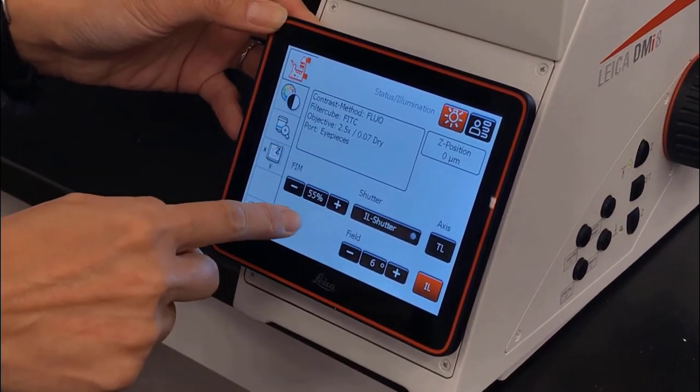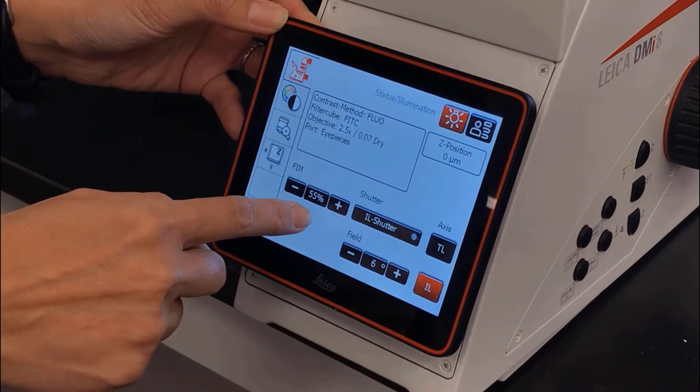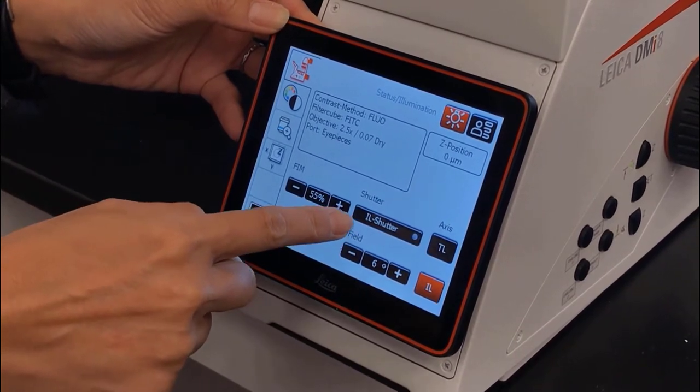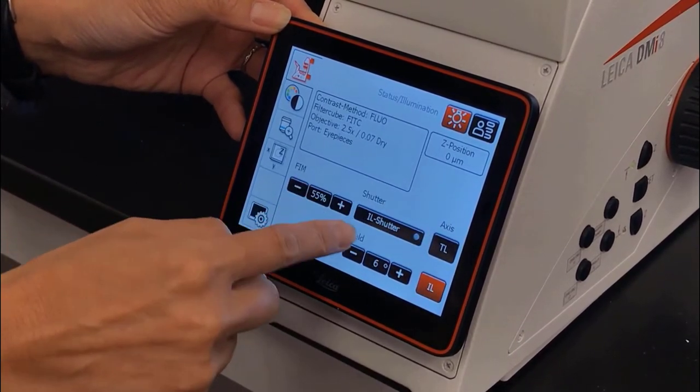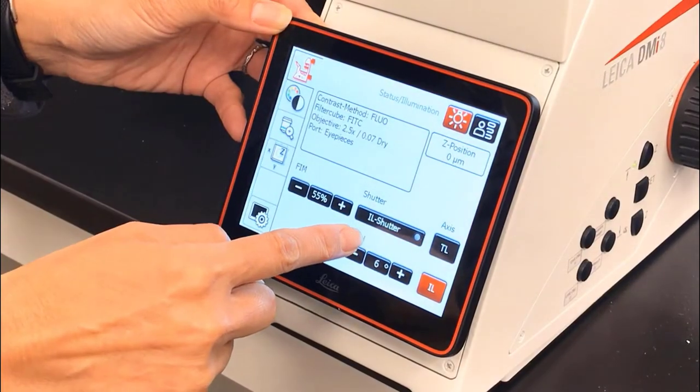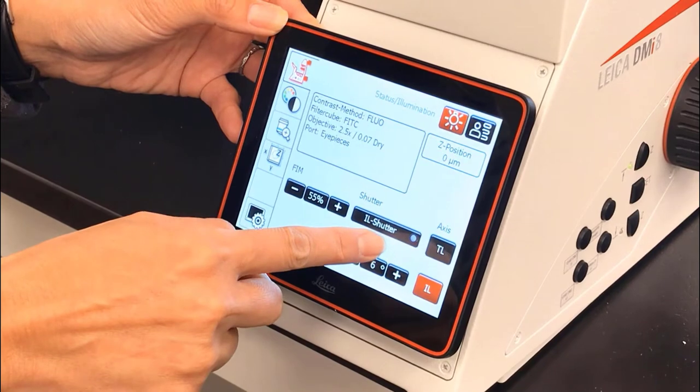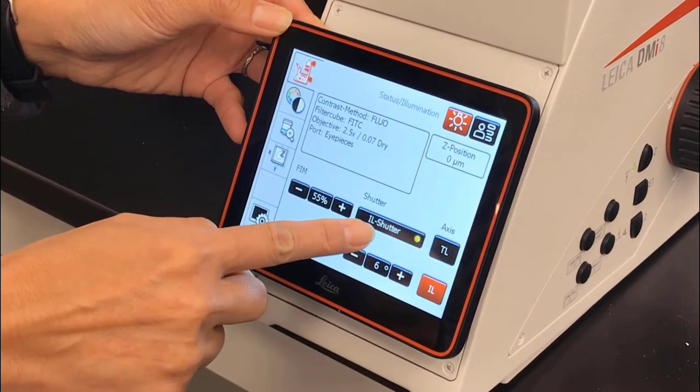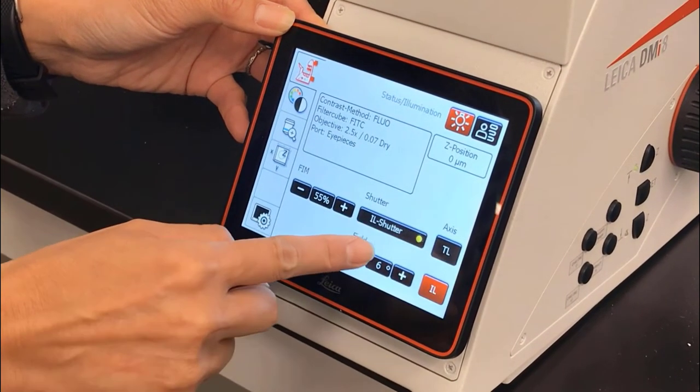We have this FIM, which is the fluorescence intensity manager. We can open or close the shutter with the shutter button. The yellow light indicates that the shutter is open.